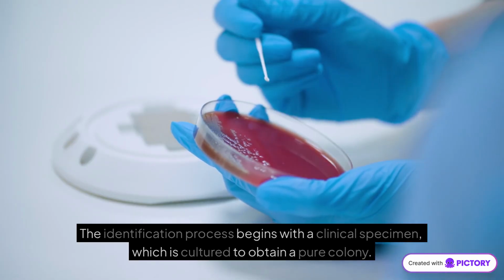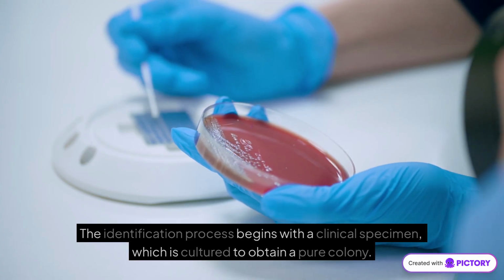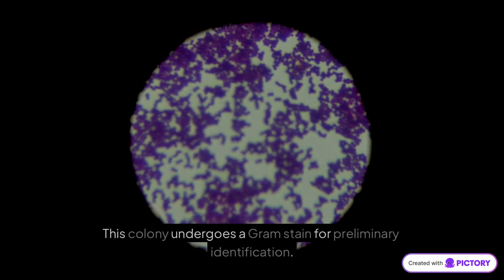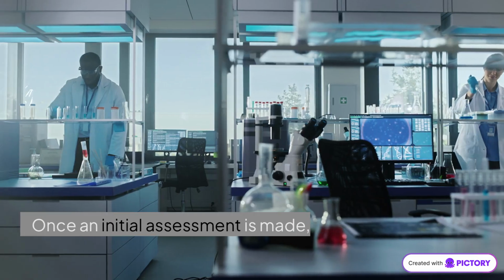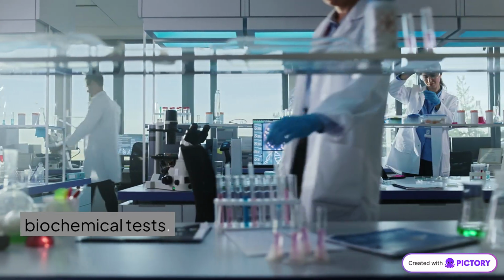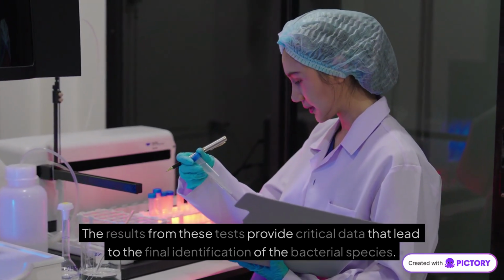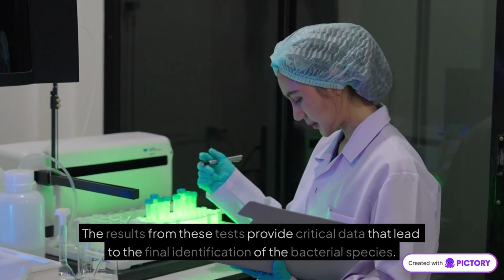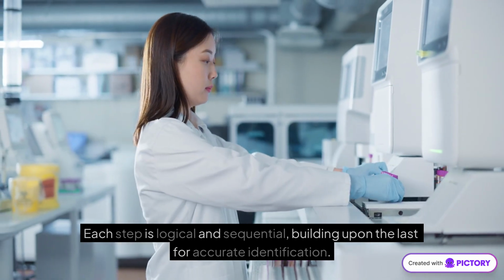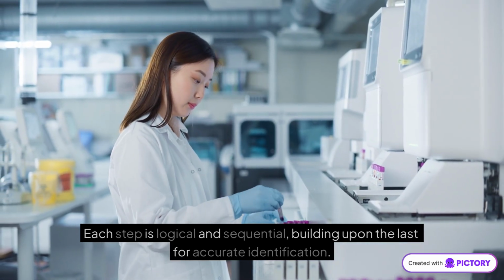The identification process begins with a clinical specimen, which is cultured to obtain a pure colony. This colony undergoes a gram stain for preliminary identification. Once an initial assessment is made, microbiologists select appropriate biochemical tests. The results from these tests provide critical data that lead to the final identification of the bacterial species. Each step is logical and sequential, building upon the last for accurate identification.